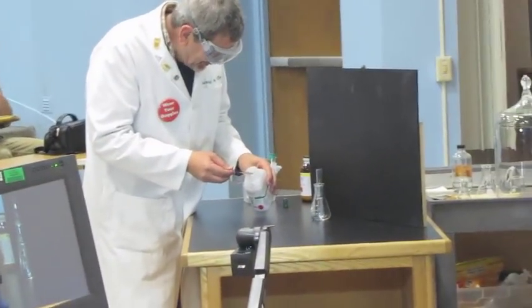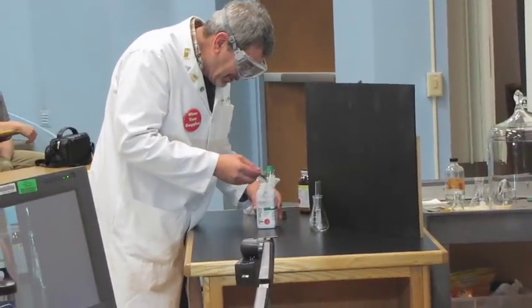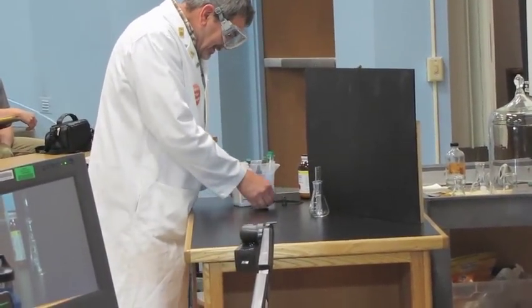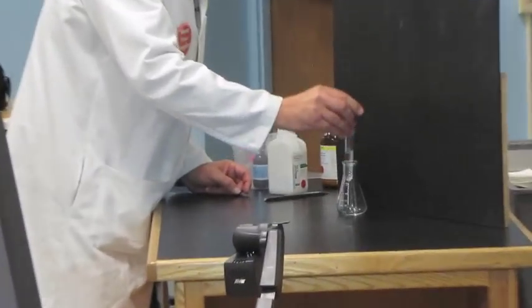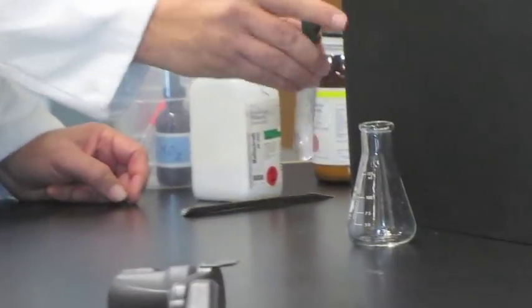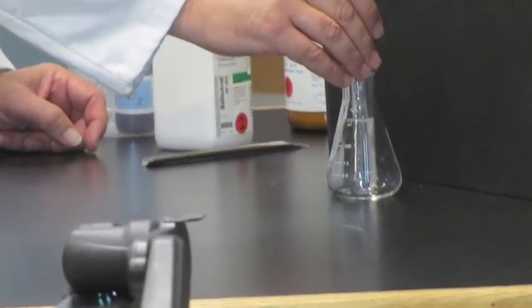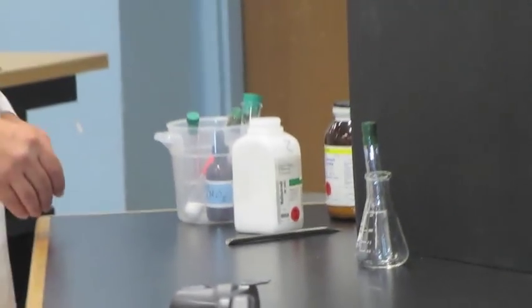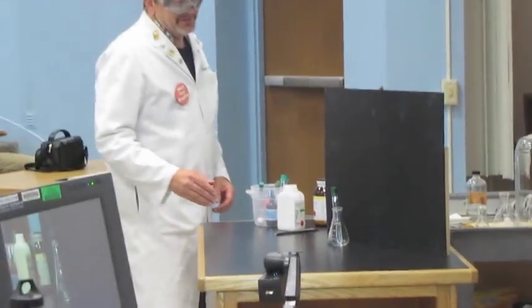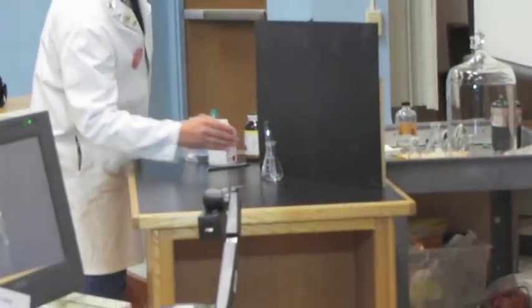Carefully measure quantity of potassium chloride. There we go. Take it around and see if it dissolves. Did it dissolve? Look, it's actually, you've got too much. It's clear.